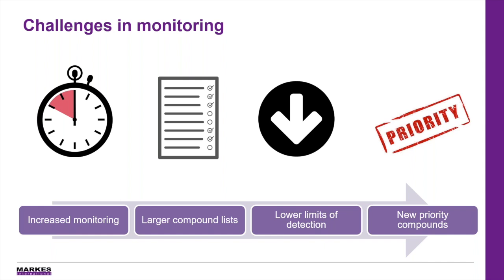A recent example that we're going to be talking about today is the update to US EPA method TO15. On top of that, air research continues to identify new and challenging compounds to monitor, such as PFAS, microplastics, and particulate matter, which dominate the global environmental news today.